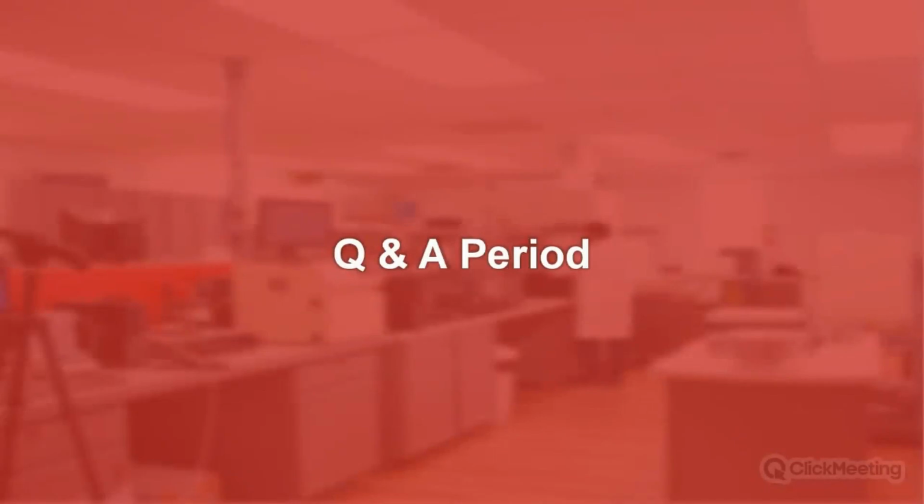We had a few questions already, one of them being how many steps of temperature can you automate through the range? That's of course really up to the user. There is no defined limit. So it really does depend on how many steps you feel you need to fully characterize your material across your material's use. What is the upper temperature range? The upper temperature range is a mean of 300. So the actual temperature range of the plates can go up to 310 degrees so that you can reach a mean of 300 if that's your upper temperature.